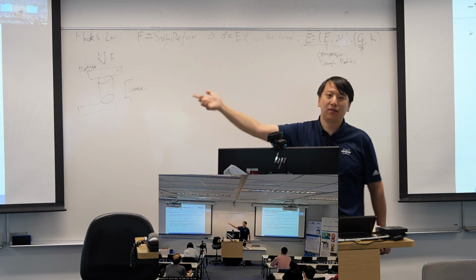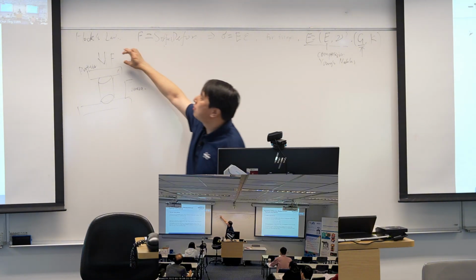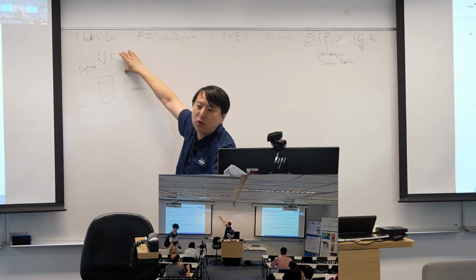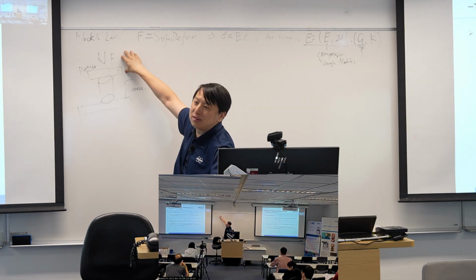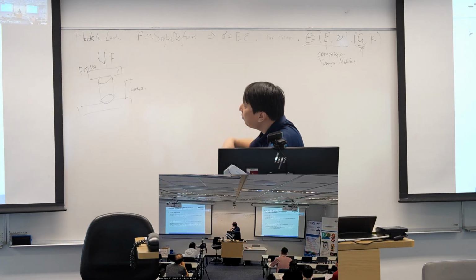The nano indenter is this kind of principle. There is a force transducer, or a force stylus, and it can monitor the force. And there is a position sensor inside the stylus. So that is the principle of the nano indenter.